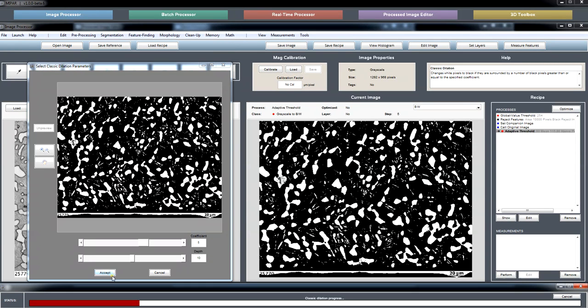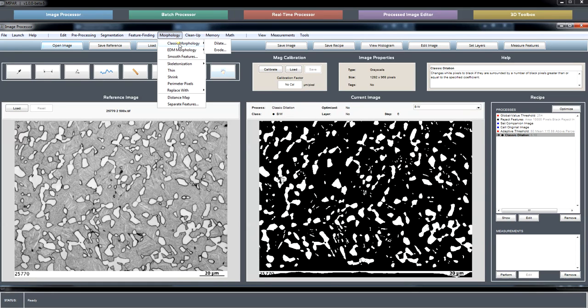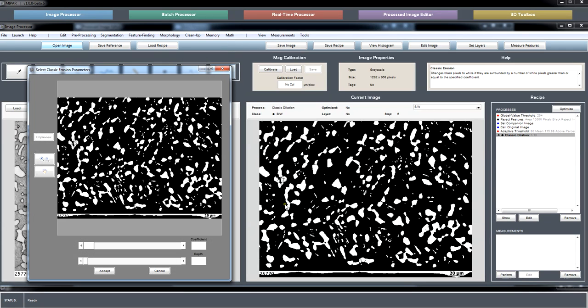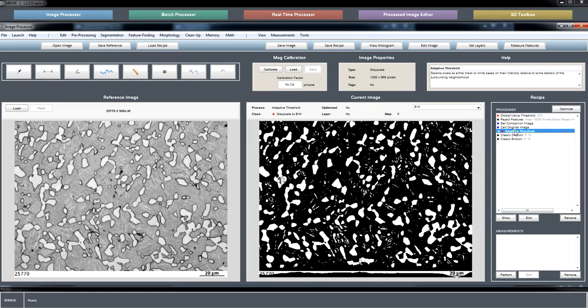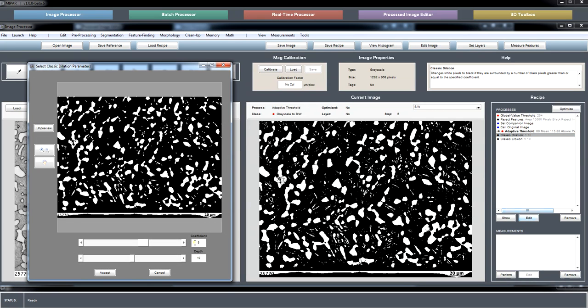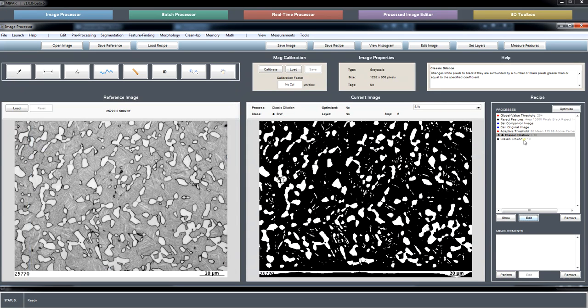We could try some noise cleanup here and some on the other end. Want to try to avoid adding that artificial cluster.